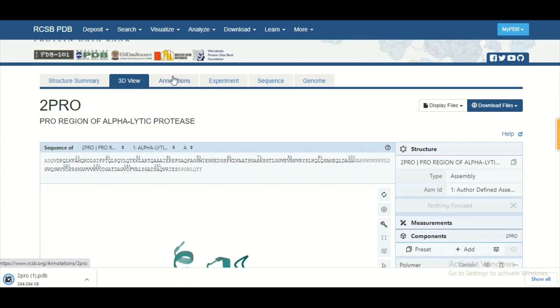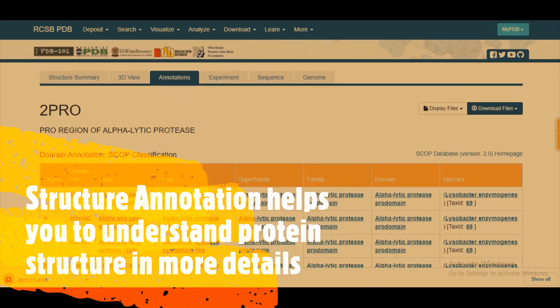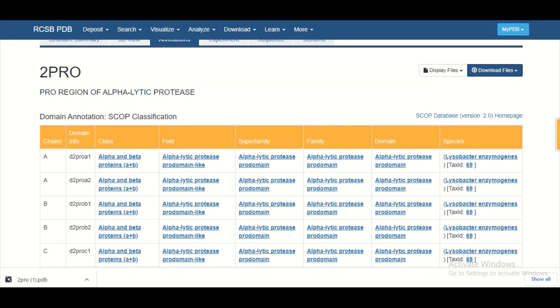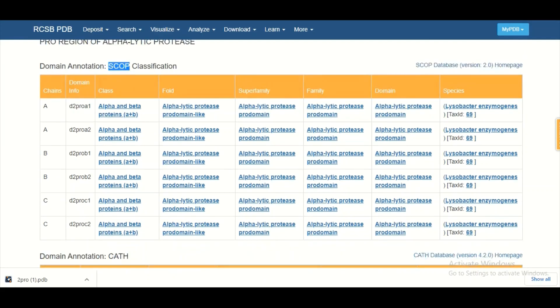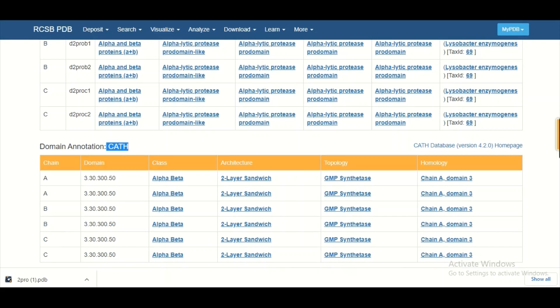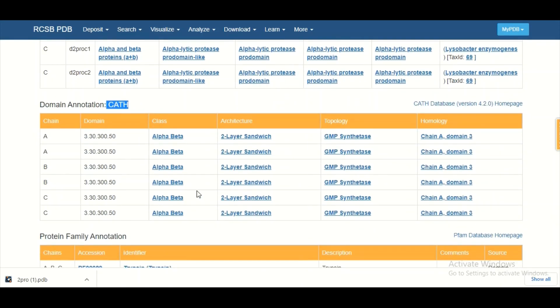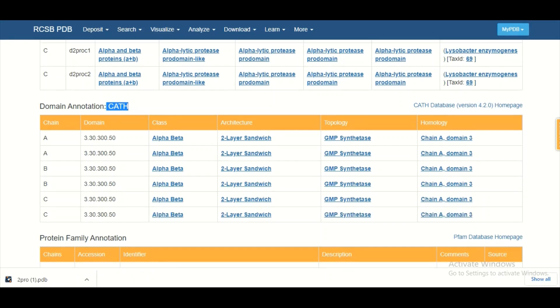The annotation tab holds a good amount of information. In this tab, you can get an idea about the fold of the protein, the family of the proteins, and the domains present in your protein. There are two different classification systems: SCOP and CATH. Both are valid and give good insight about the protein. According to the SCOP classification, you can see the fold, family, superfamily, and domain. CATH similarly provides the class, topology, and homology of the domains.